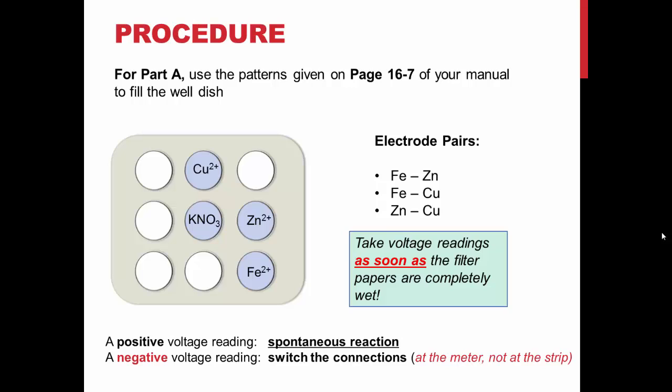Measure the voltages between the species shown with a voltmeter as soon as the filter paper is completely wet. A positive reading indicates a spontaneous reaction. If a reading is negative, switch the connections of the wires to the voltmeter.